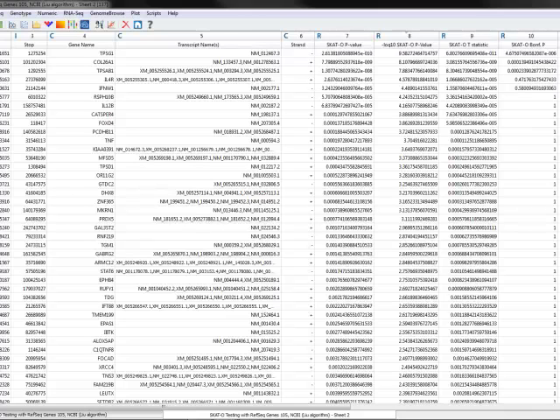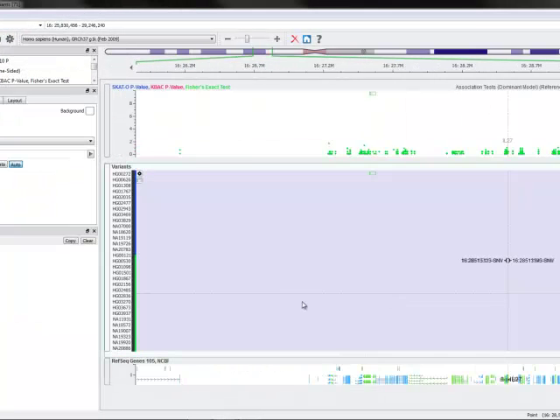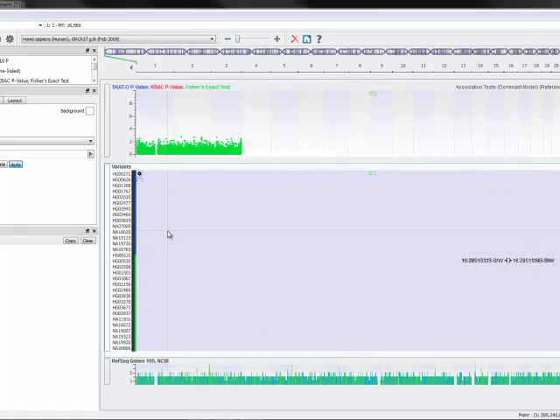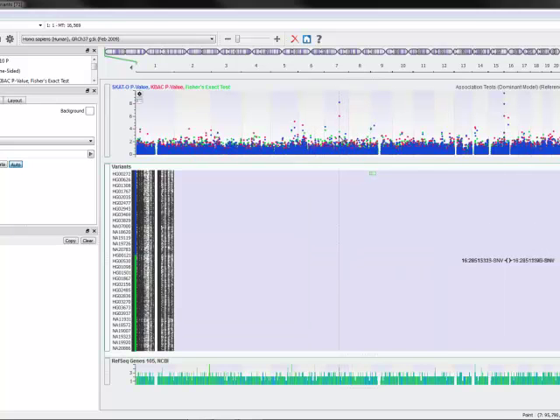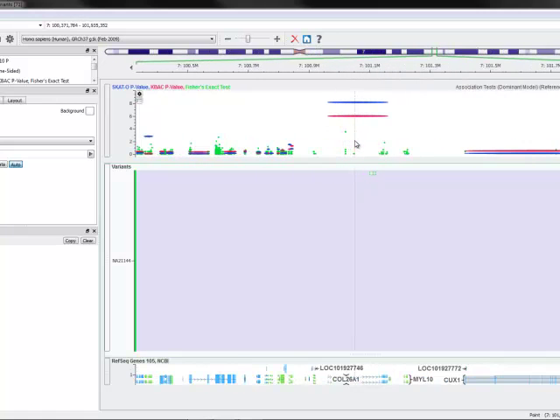And if we look at it visually, in this plot now we'll see, go ahead and zoom out to the whole genome level, all of those p-values. So in green, what it's drawing in right now is the individual SNP level associations. In a moment, it will update with the KBAC and SKAT tests, and we'll start to fill in the whole exome variant summaries.